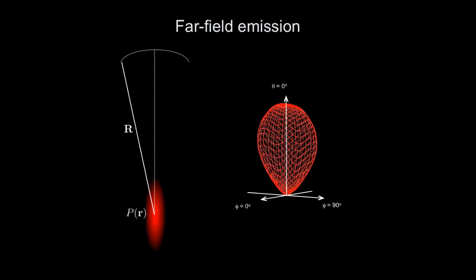Here's this is a calculation. This is exactly what we've done. This is basically my focal volume. Lots of molecules here. They all emit waves, but the waves are in phase. So if I want to know the detection and what the intensity is on this plane, what I have to do is for each point in this plane, add up all the waves that arrive there, interfere them, and determine the intensity. That's basically shown here.